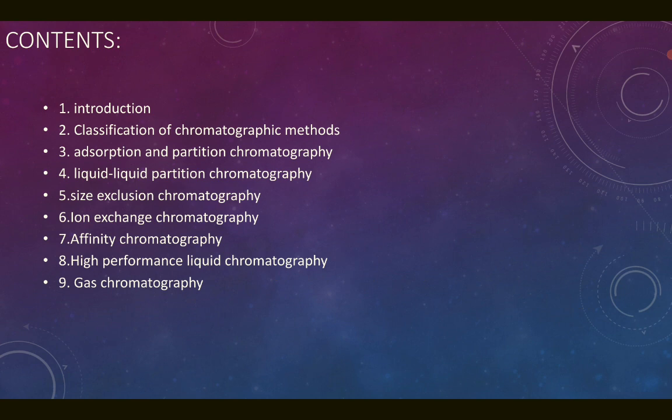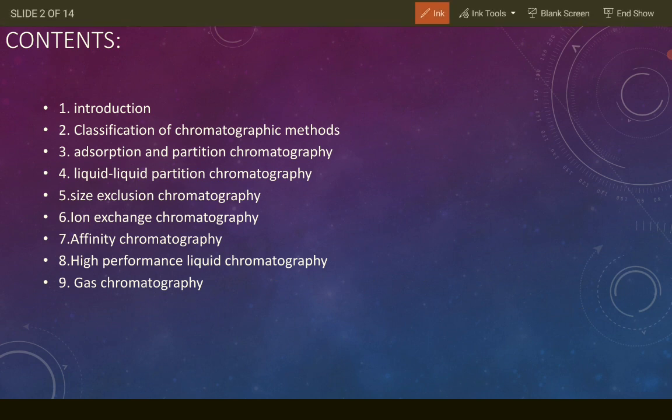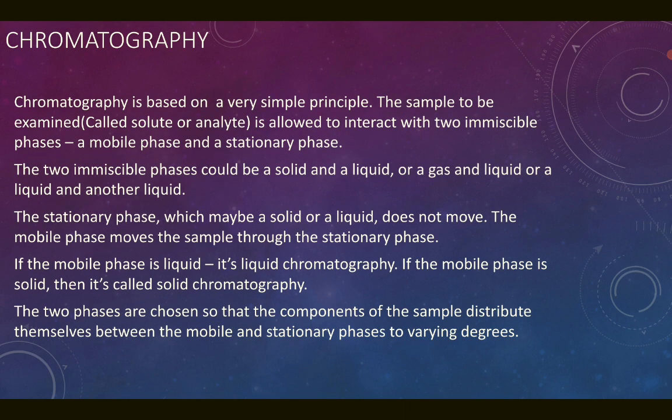So the contents or the important topics that we need to cover in chromatography are its introduction, what is chromatography, classification of chromatographic methods, adsorption and partition chromatography, and there are the rest which we'll cover in the second video, while in this video we'll only cover up to adsorption and partition chromatography. So let's start with that.